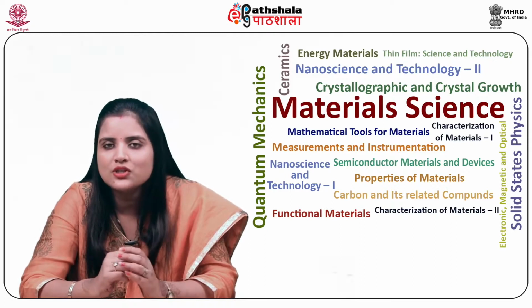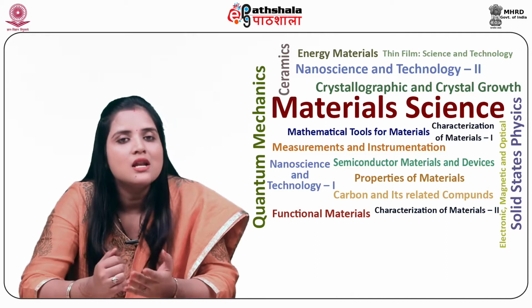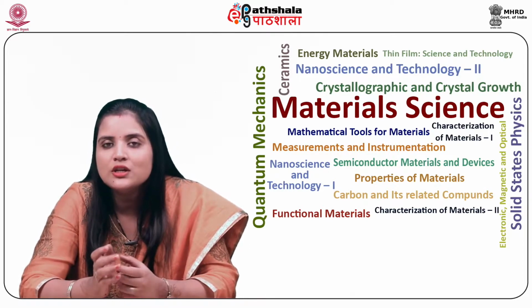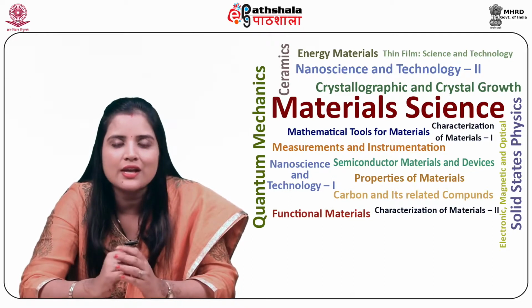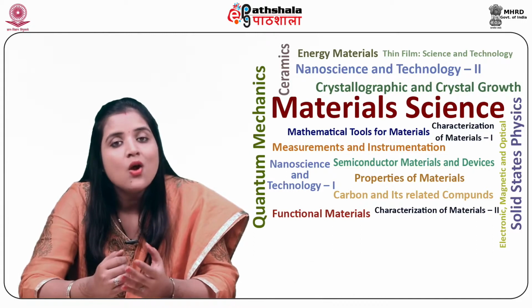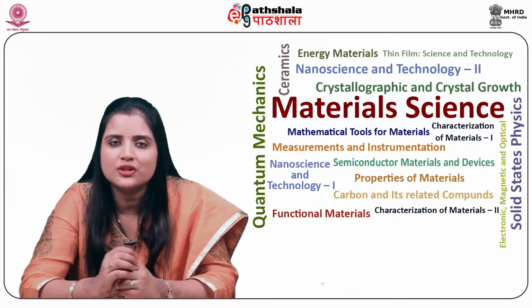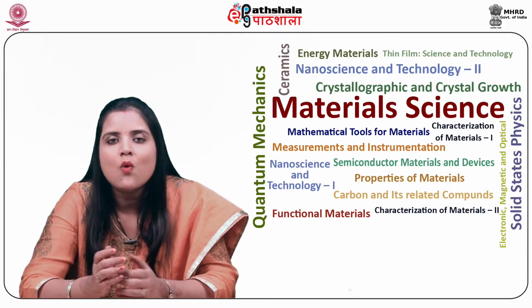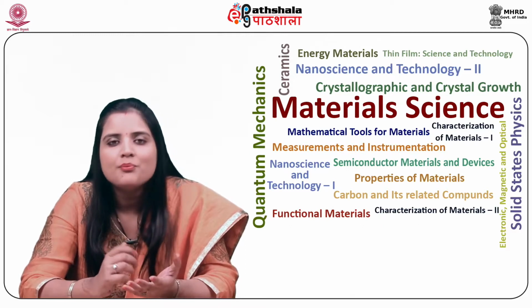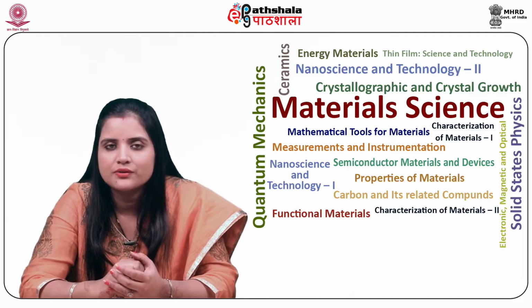Analyzing a sample with low incident accelerating voltage can cause some problems. First is that high excitation energy based characteristic X-rays cannot be detected. Secondly, quantitative analysis accuracy is degraded. Third, while performing the analysis or X-ray mapping, position shift in the incident electron probe occurs.